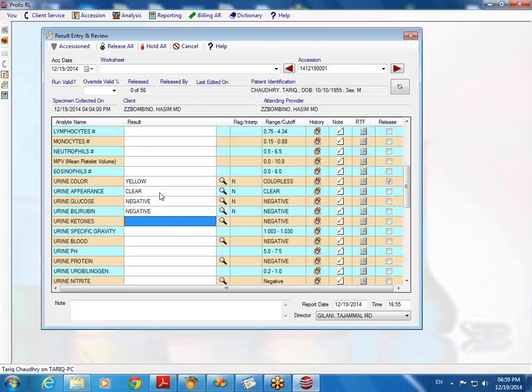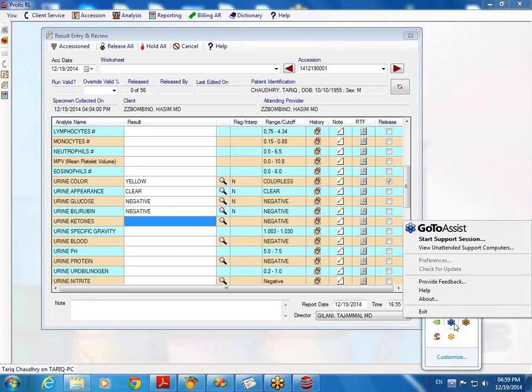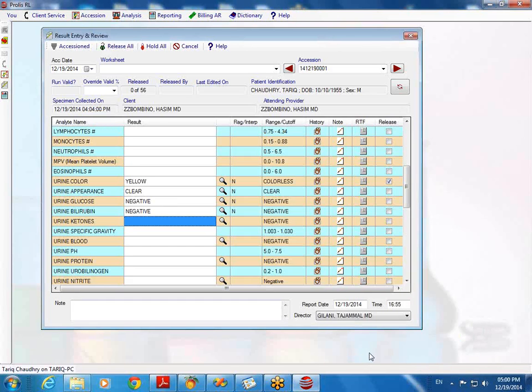You could have the interface like, let me show you one interesting thing while you're on the screen. Just so you know, we have to wrap up for another meeting soon. Okay, let's do this some other time. But right now, one of our clients in New York is running about 18 interfaces currently. You could have the same arrangement, we could provide you different interfaces.